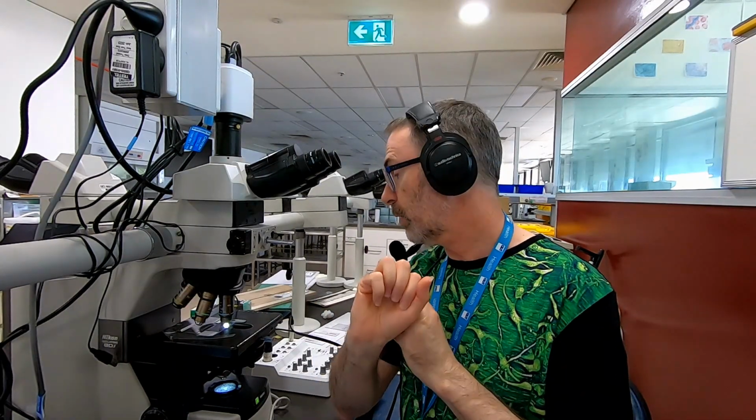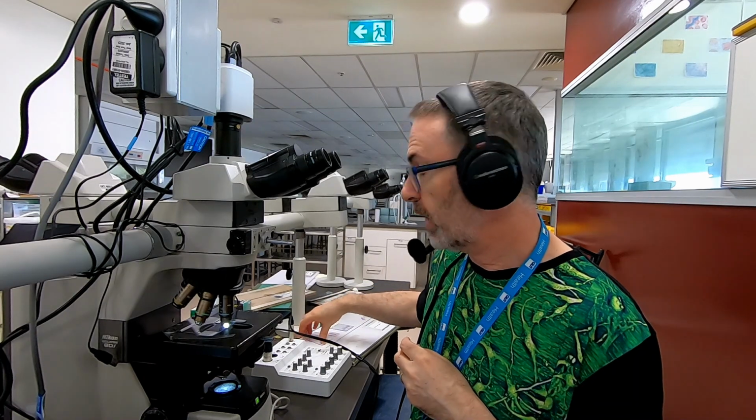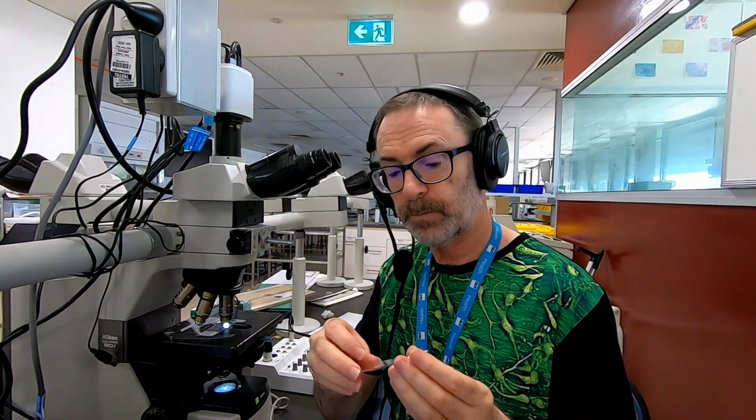Okay, so thanks for your attention. That's the foundation. When we come back, we are going to apply all that knowledge using not only the PAS stain and Alcian blue, but also a third dye called mucicarmine. And we'll apply that knowledge to take a journey down the length of the digestive tract, and we'll see how the relative composition of acidic and neutral mucosubstances changes as you move from one area to the next.